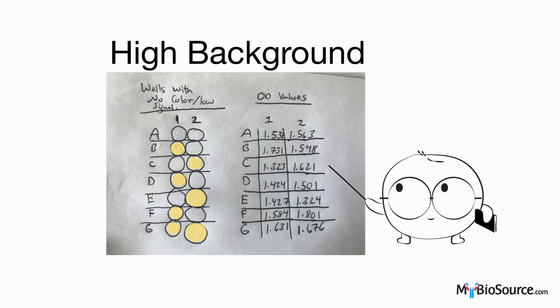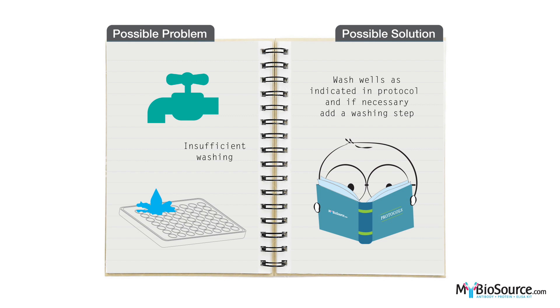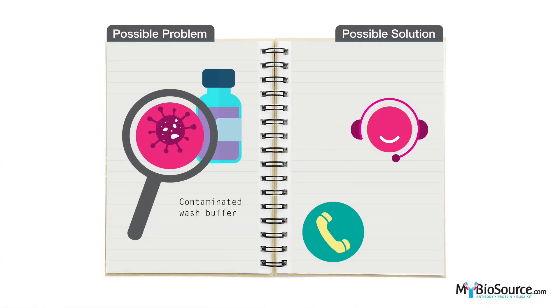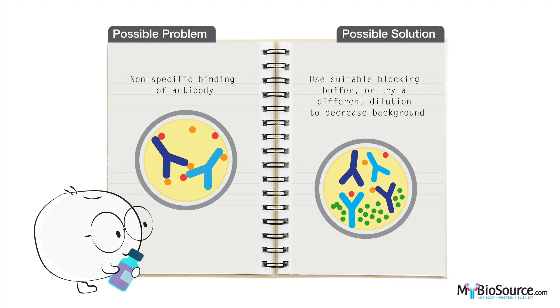Moving on to problems with high background. The following scenarios may cause these: insufficient washing during the washing step. Please confirm wells are washed according to the protocol, and if necessary you may add a washing step. In rare occasions the wash buffer may be contaminated; in this case please contact our technical support team for further instructions. High background may also be due to nonspecific binding of the antibody; therefore you may want to try using a suitable blocking buffer or a different dilution factor to decrease background.